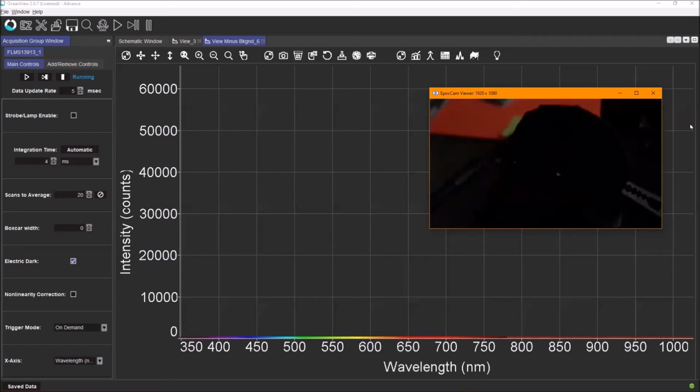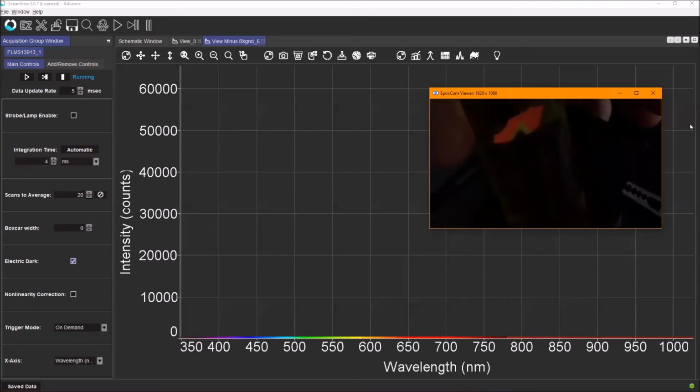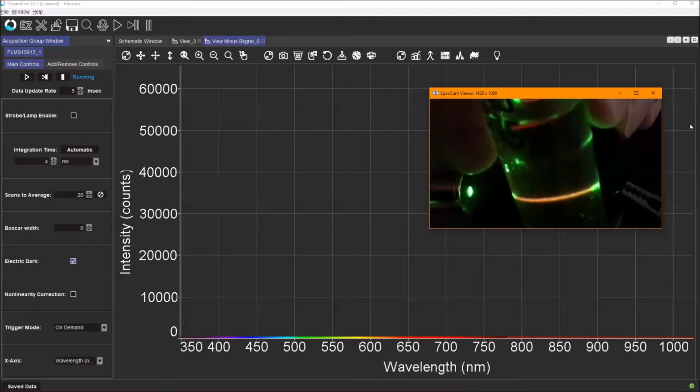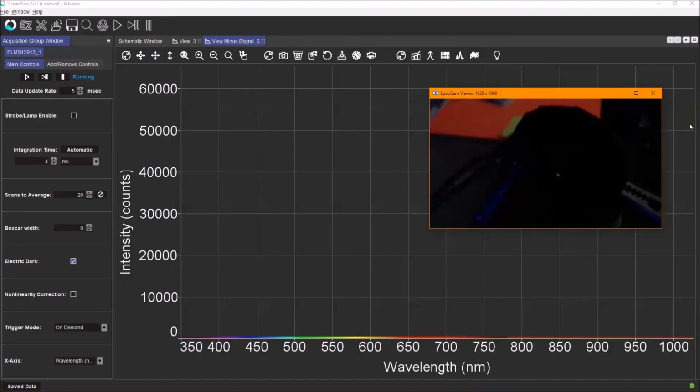Another demonstration of fluorescence is virgin olive oil. Looks just regular transparent yellow under normal light. If I use a green laser across it, it turns red. This doesn't show up on the spectrometer, but it's a green laser at 532 nanometers, and this fluoresces in red. Very spectacular. Oh, and minions don't fluoresce at all. Okay, that's it for fluorescence.